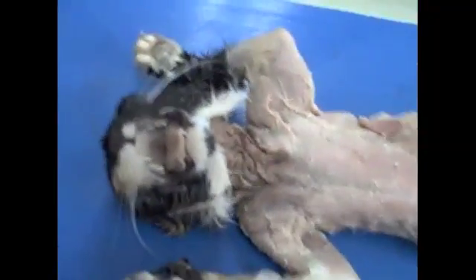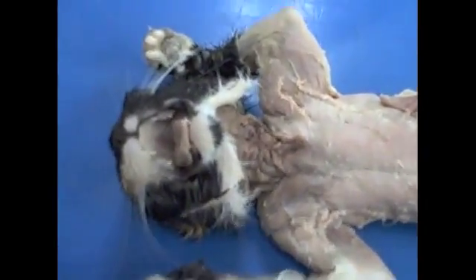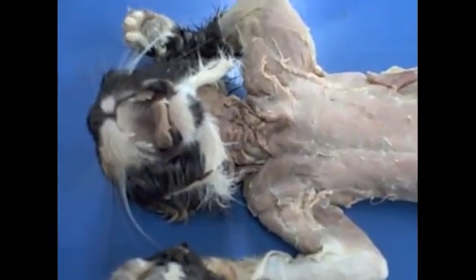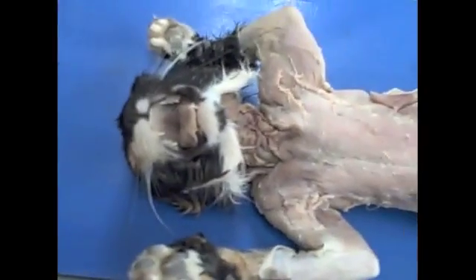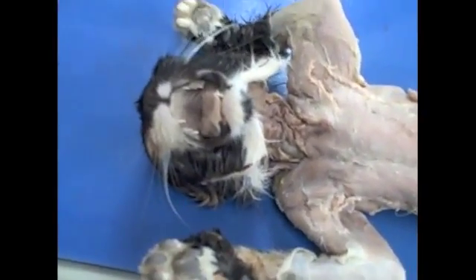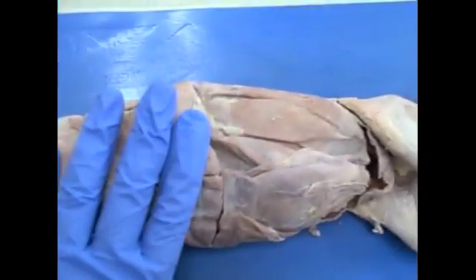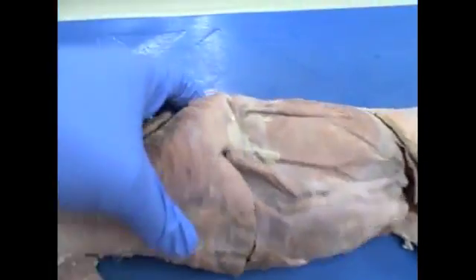This is our cat, Tiger, and we will be dissecting it and showing you the muscles and perhaps some of the organs. This is the anterior end, which is near the head, and then here's the posterior. And then we'll also be saying this is the ventral side, which is on its abdominal side, and then dorsal is on the back.